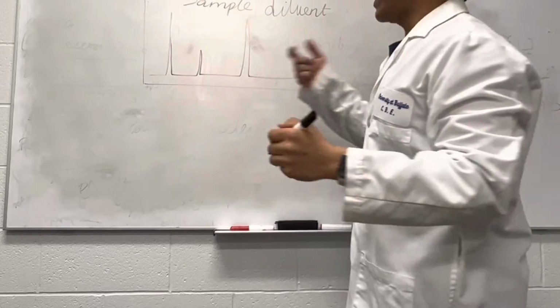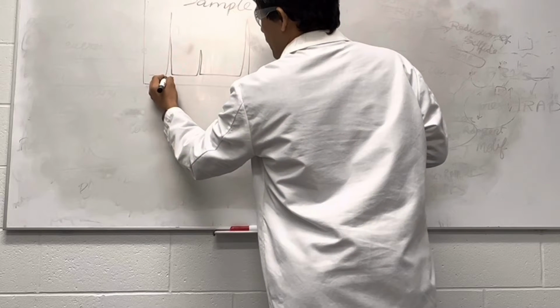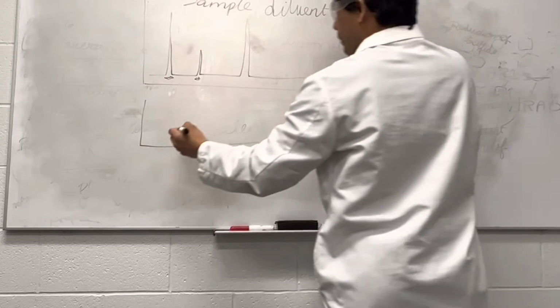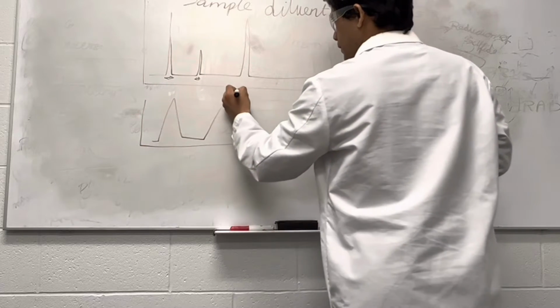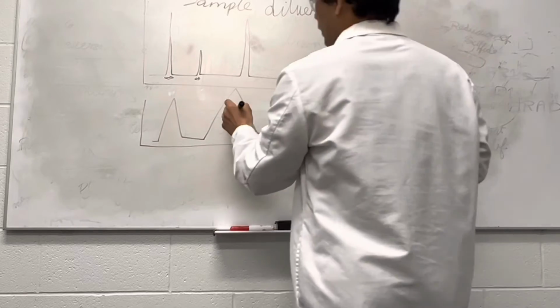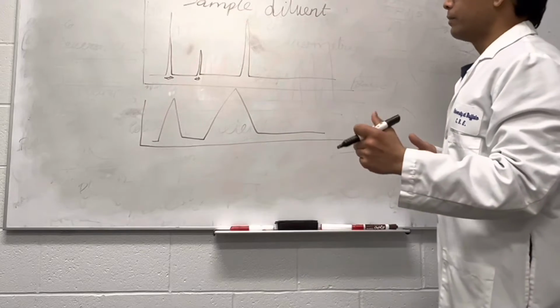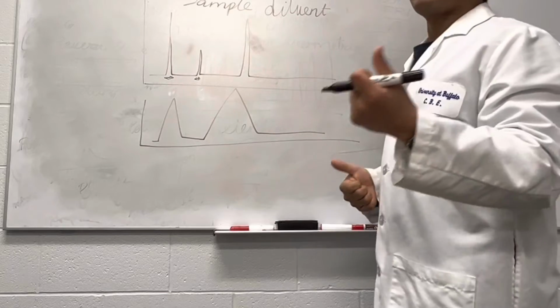This is something like an ideal chromatogram, where this gap is minimum. And if there is a widening of this gap, the chromatogram is not so good, as in this case there might be a possibility that these two might have combined together to give this peak. So this can be taken care of by using an appropriate sample diluent.